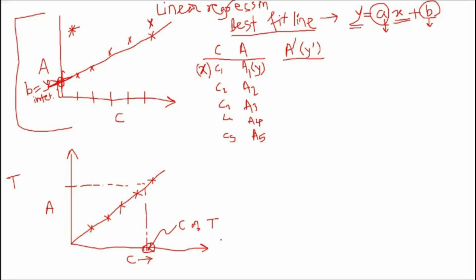But generally, the concentration of test that we find is of the diluted solution, because the UV spectrophotometer cannot take the absorbance of a concentrated solution, so we need to dilute it. So if this is the concentration we have found out, if it is the concentration of the diluted solution, how can we find the concentration of the original solution from this diluted solution? Excellent. People are very smart now, multiplying by dilution factor. So after finding out this concentration, you will multiply that with the dilution factor. Excellent. So this is the experiment we are going to do today.